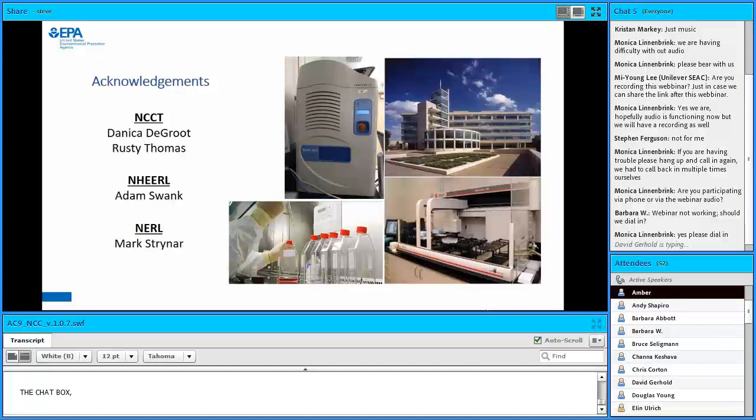Steve, I actually have never worked with these cells, so this is only just for my own personal understanding, but during your optimization process when you were transfecting these cells, it seems like you were concentrating on using a chemical process. Is there a reason why or why not you would use something like electroporation or something like that, I guess? And if you don't mind repeating the question for folks on the line. Right. So the question is why we focused on using a chemical method to introduce RNAs into HEK293T cells and not some other method like electroporation.